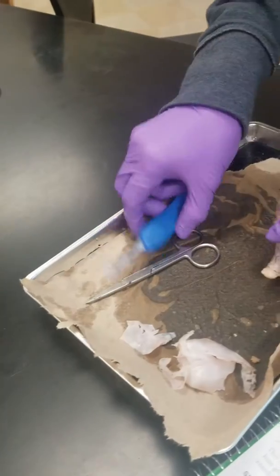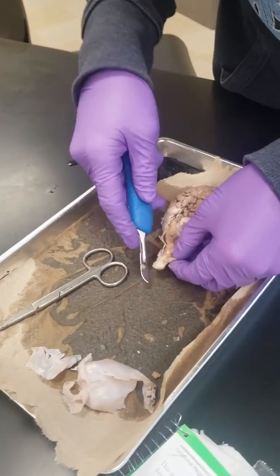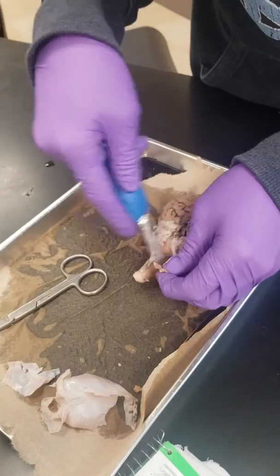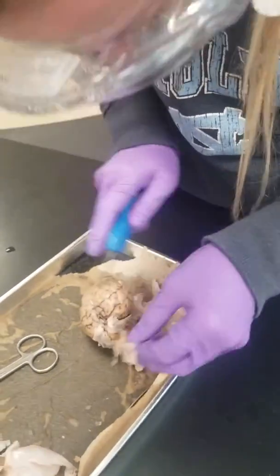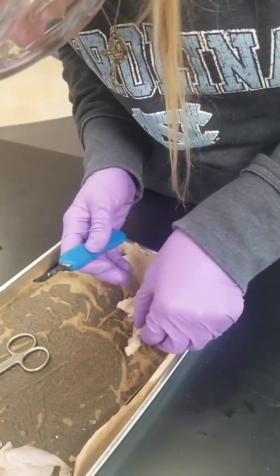Now you can see sort of the lobes. There's the frontal lobe, and you can see the central sulcus, and then the frontal portion, and then the back portion.